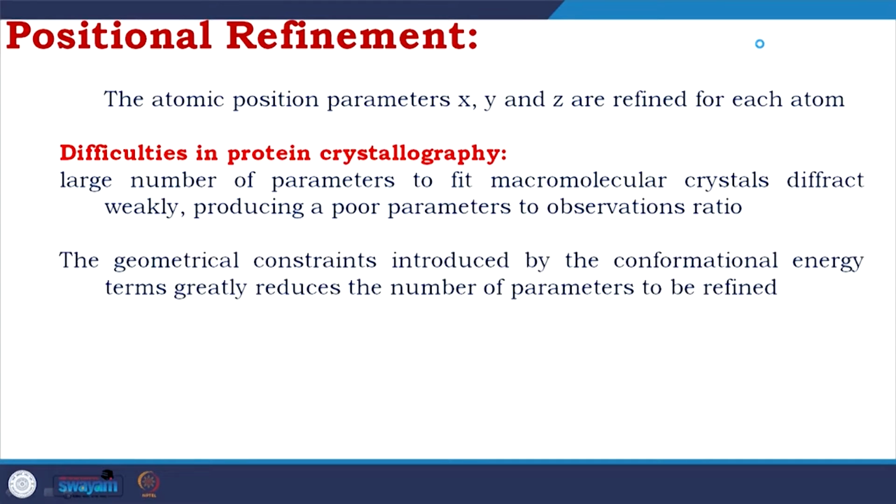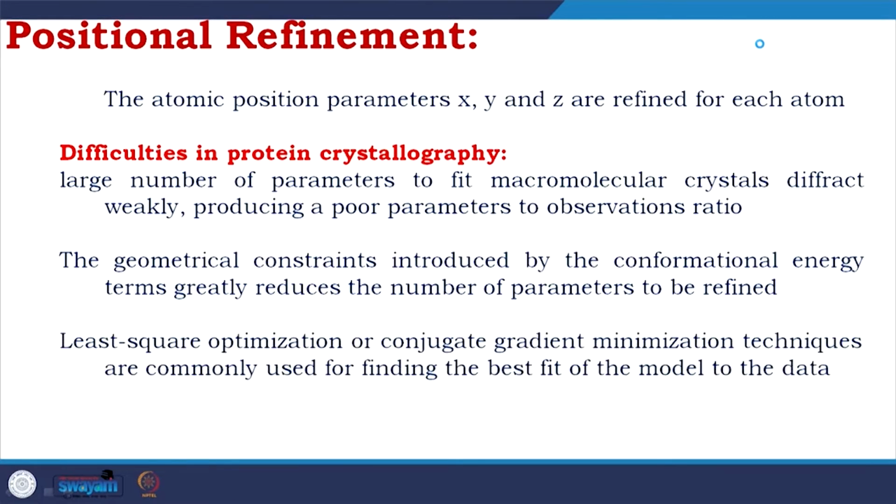The geometrical constraints introduced by the conformational energy terms, which are bonded terms, greatly reduce the number of parameters to be refined.